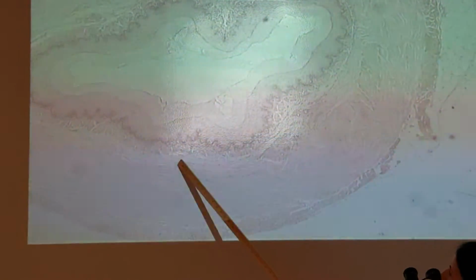This right here represents that submucosa layer. There's not a lot in it. It looks very kind of nothingness that's there. Submucosa right here.